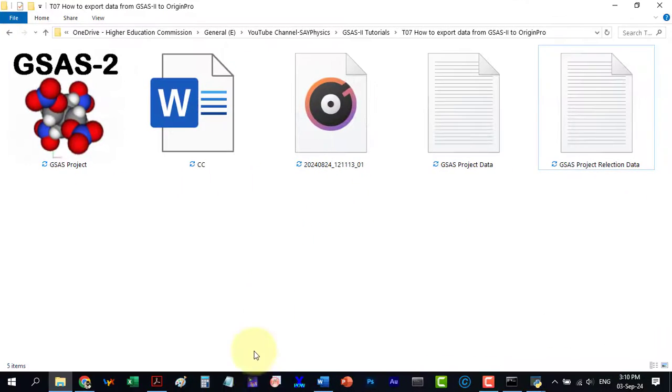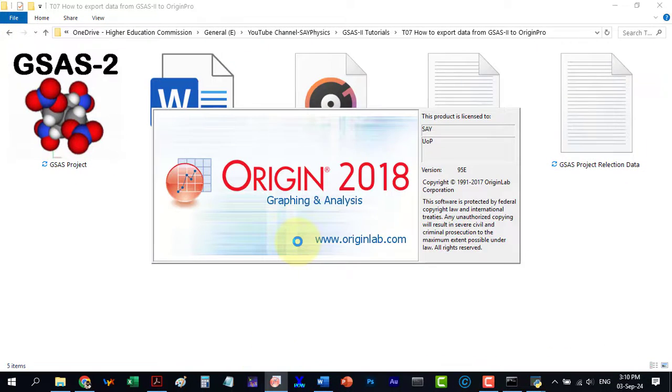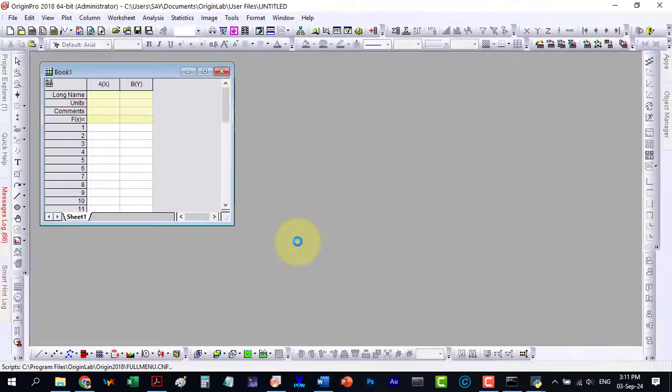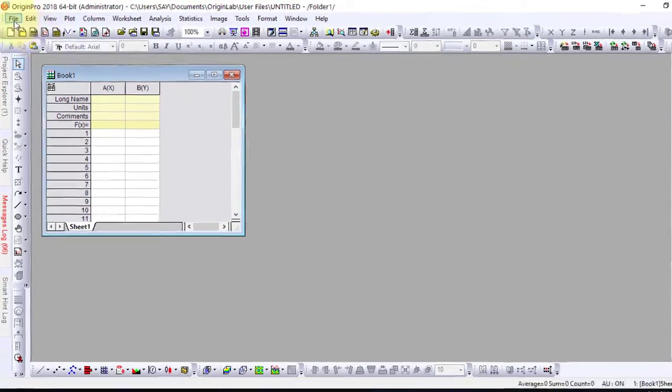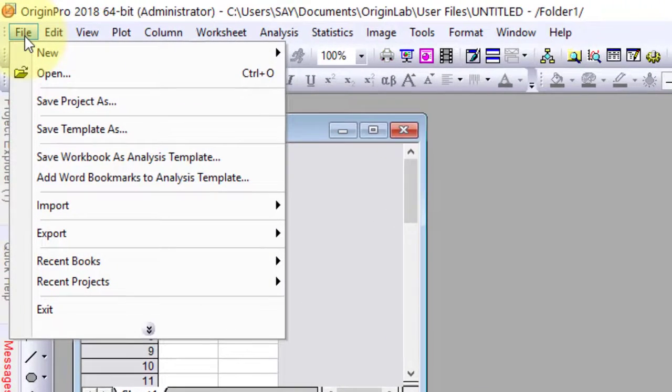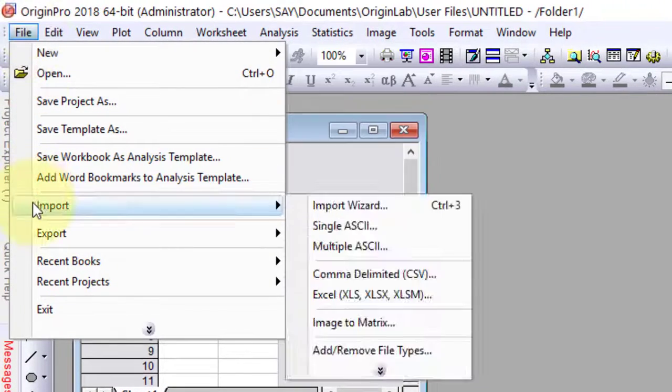To plot the data in Origin Pro, I will first open Origin Pro and then import the data file.